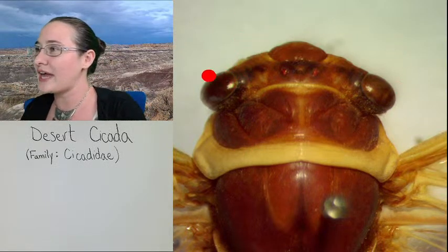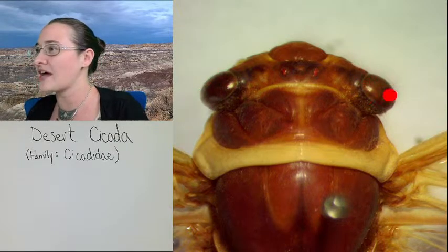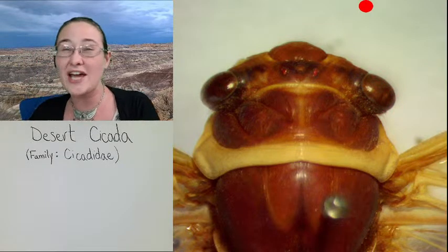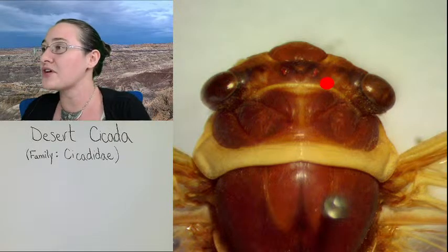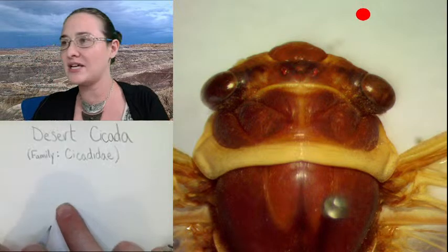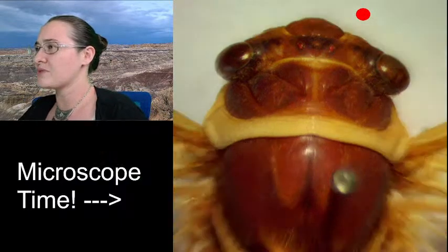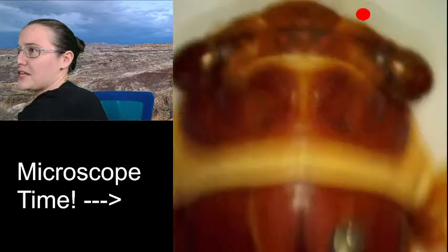All right, so we are looking at the front of our cicada. This is our first compound eye over here on the left. This is the compound eye on the right. And cicadas do have three ocelli, meaning they have three simple eyes. They're in a triangle formation. So there's one here, and then kind of one up here. The third one on the top of the pyramid is a little bit more difficult to see. I wonder if I zoomed in just a little bit, we might be able to see it a little better.